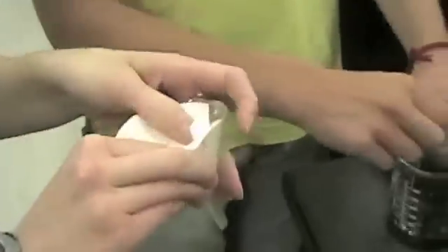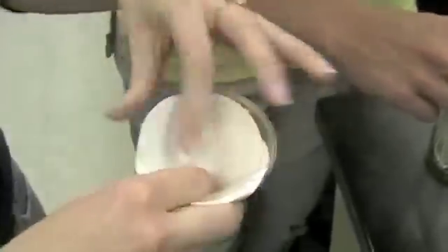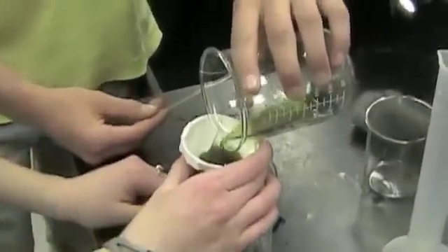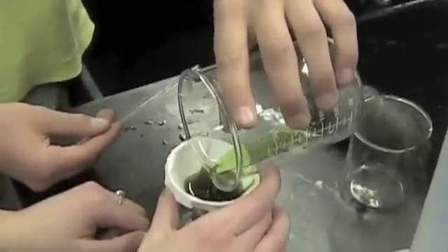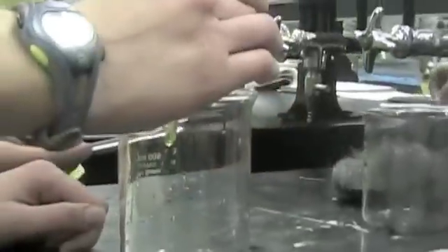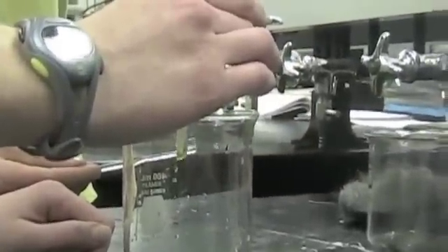Now, John's gonna teach Courtney how to filter using a little origami. Hi, John. Thank you, John. Now onto filtering, which could be made much faster with the Buechner funnel. So we don't have that, so we're gonna wait.